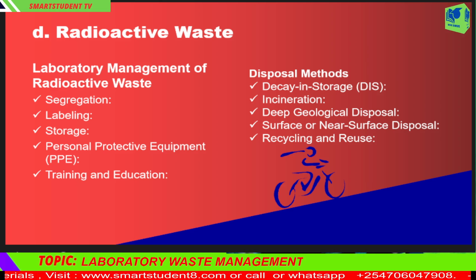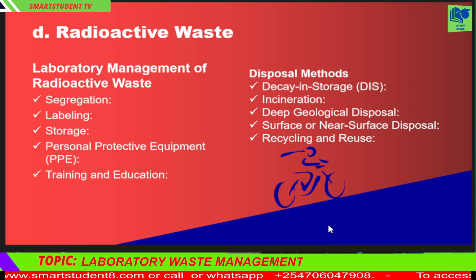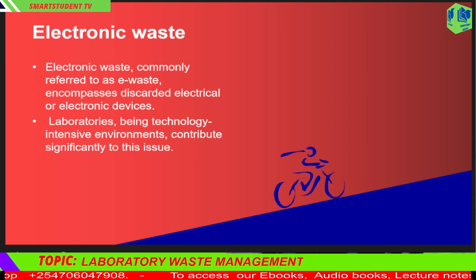Finally, let's discuss electronic waste management in the laboratory. Electronic waste, commonly referred to as e-waste, encompasses discarded electrical or electronic devices. These devices are no longer functional, have become obsolete, or are simply unwanted. With the rapid advancement in technology and the decreasing lifespan of electronic products, e-waste has become one of the fastest-growing waste streams globally. Laboratories, being technology-intensive environments, contribute significantly to this issue.